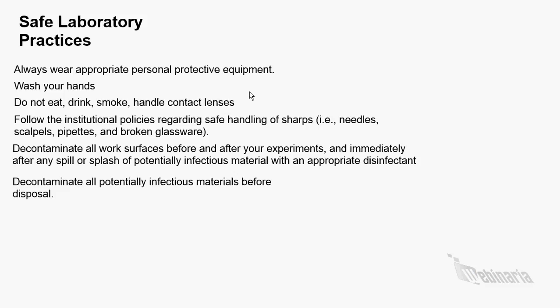So what are the safe laboratory practices? Well, always wear appropriate personal protective equipment like gloves. Change gloves when contaminated and dispose of used gloves with other contaminated laboratory waste. Don't use your gloves continuously for many days. Wash your hands after working with potentially hazardous material or before leaving the lab.